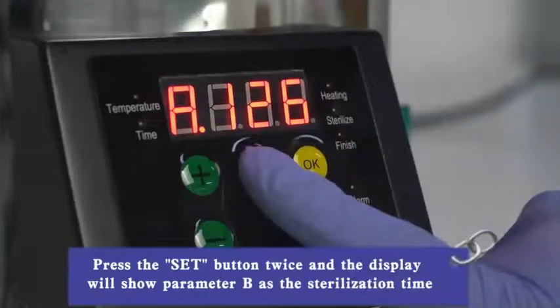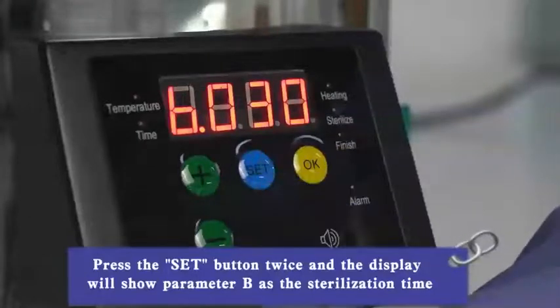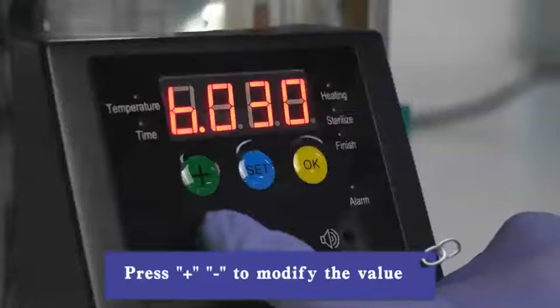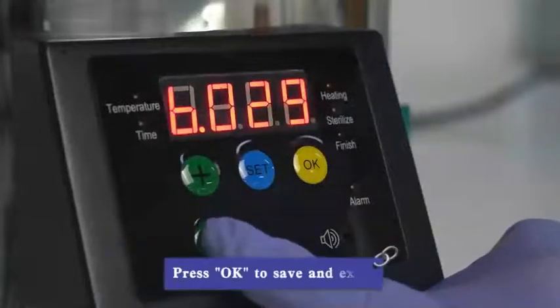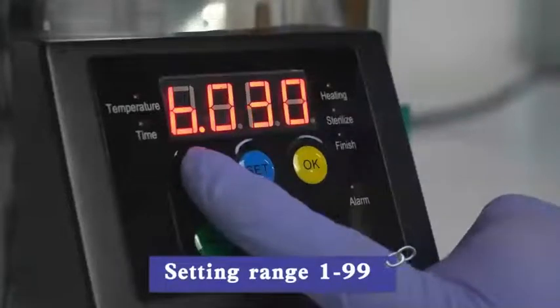Press the SET button twice and the display will show parameter B: sterilization time. Press plus or minus to modify the value. Press OK to save and exit.